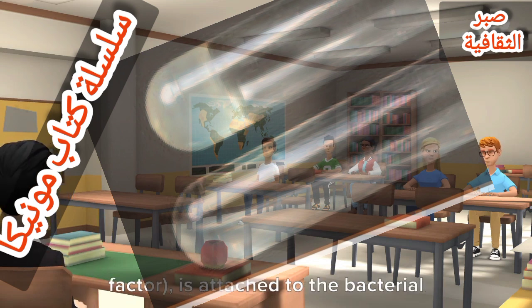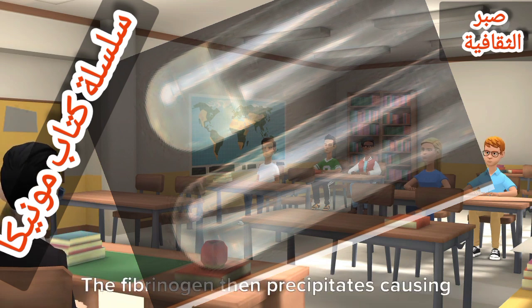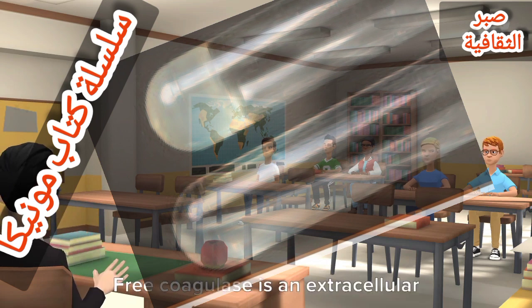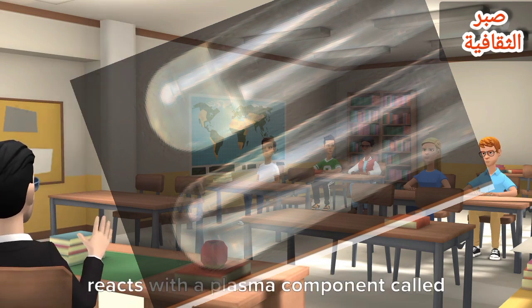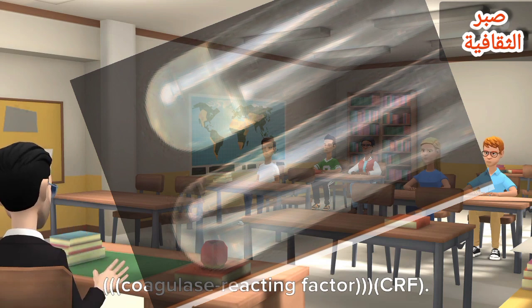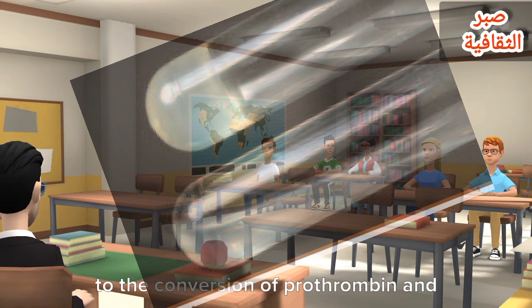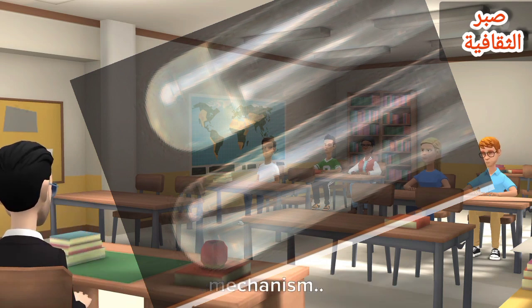Bound coagulase, also called clumping factor, is attached to the bacterial cell wall and reacts directly with fibrinogen in plasma. The fibrinogen then precipitates, causing the cells to clump together in a visible mass. Free coagulase is an extracellular enzyme released from the cell that reacts with a plasma component called coagulase reacting factor, CRF. The resulting reaction is similar to the conversion of prothrombin and fibrinogen in the normal clotting mechanism.